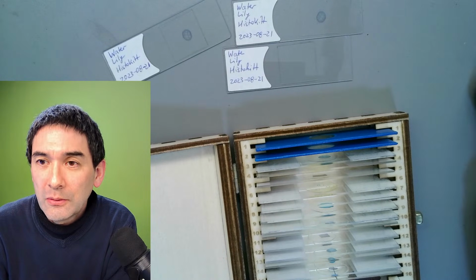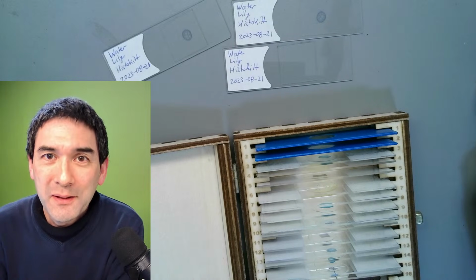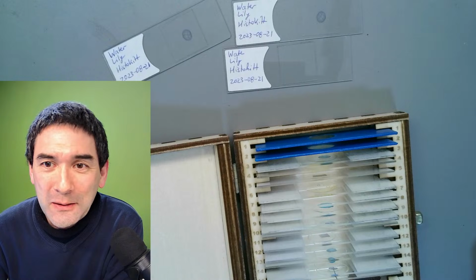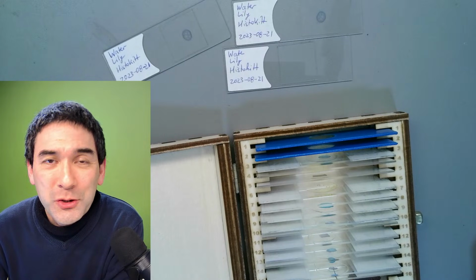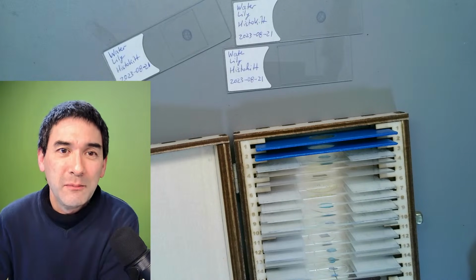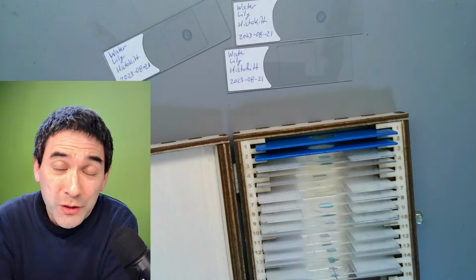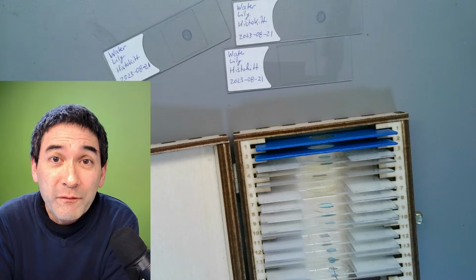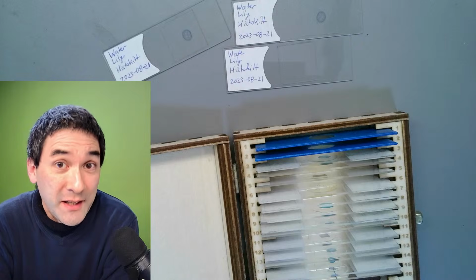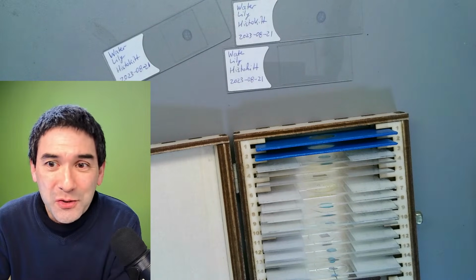Yeah, I see that several of you have already joined in. So I'm happy that we can do a little bit of microscopy every week together. As I mentioned, I'm experimenting around a little bit. You can see in two different streams either the horizontal version, but I'm also trying to do some vertical live streaming. There is also a link where you can try that out. The layout is a little bit different, and I would like to see how this works out.